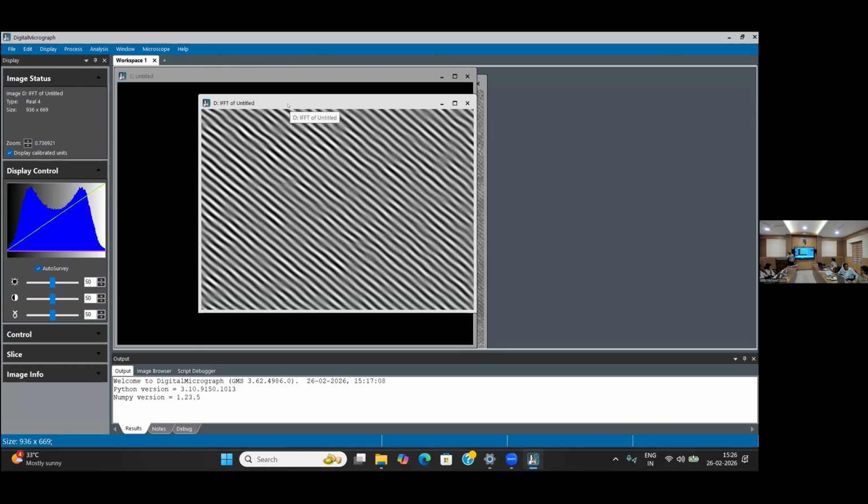Like in TEM, if you send the sample to some other lab, they will send you some 10 to 20 images. But if you go there and sit with the operator, then you can see the other areas. Because you send a sample and you inform them you are looking for some rod-like structure, then they will concentrate on this rod-like structure. They will search everywhere in your sample, and if there is some rod morphology, then they will capture that region.